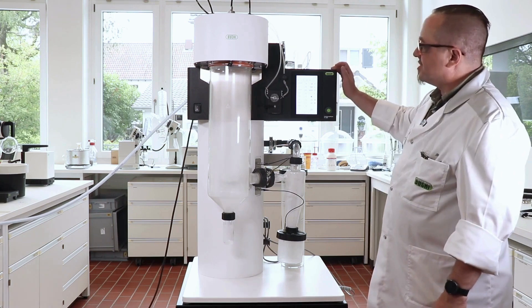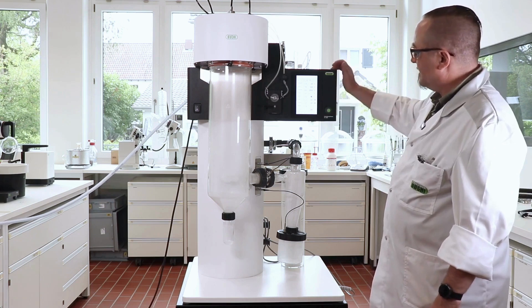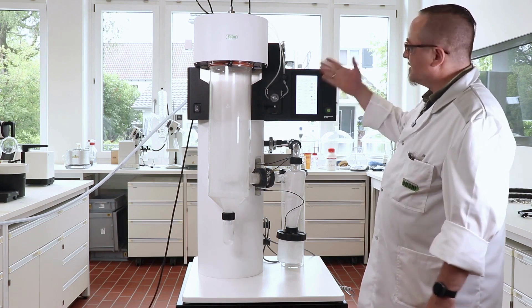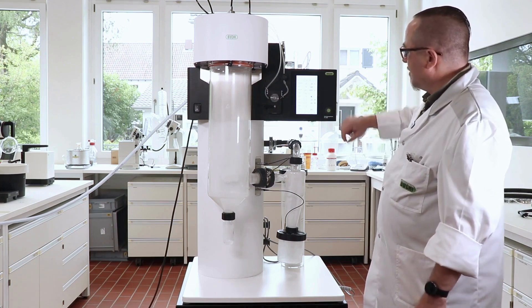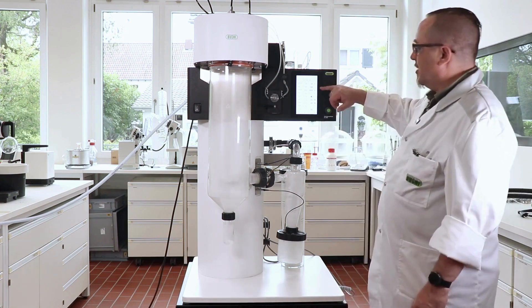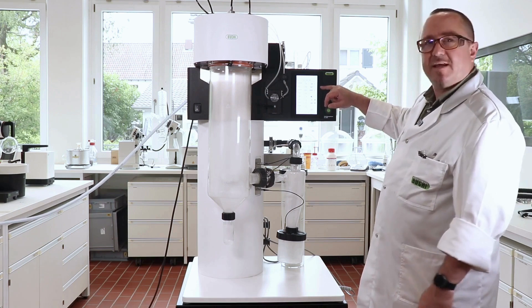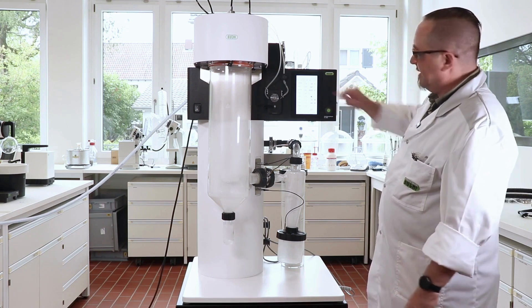We already flushed the tubing quite well. What we do now is initiate the stopping process. We will stop first the temperature, give it a little time because we still evaporate the solvent, and then stop the solvent as well. Now we have to wait until the inlet temperature comes down to about 80 degrees Celsius — this can take quite some minutes.